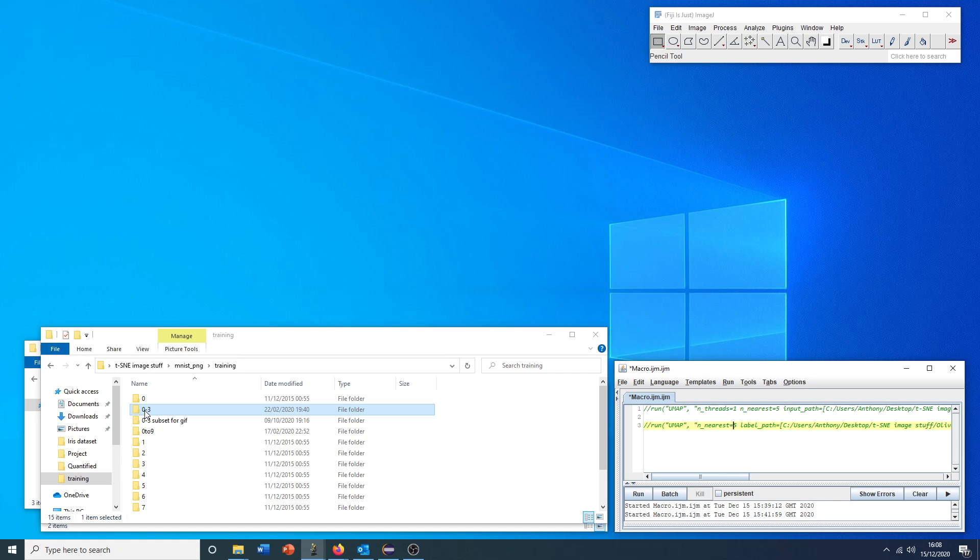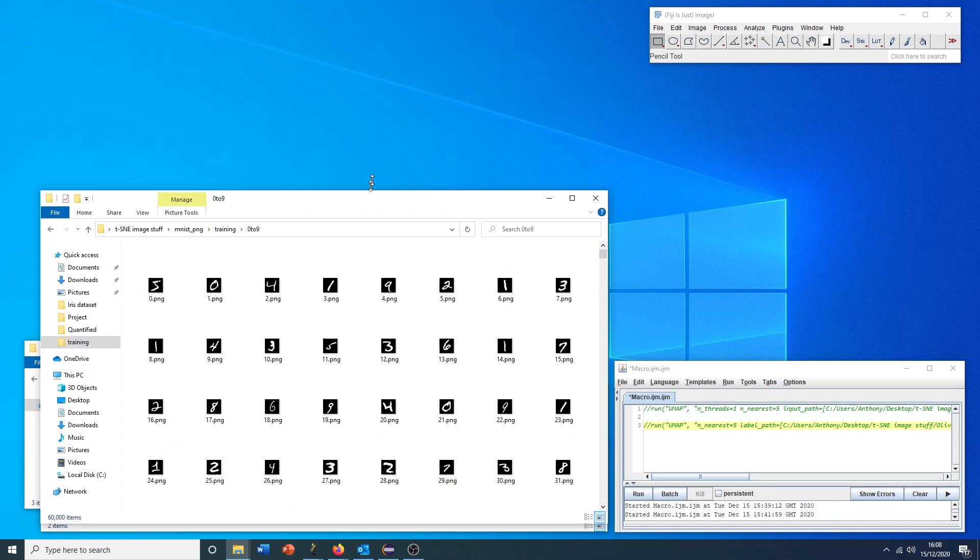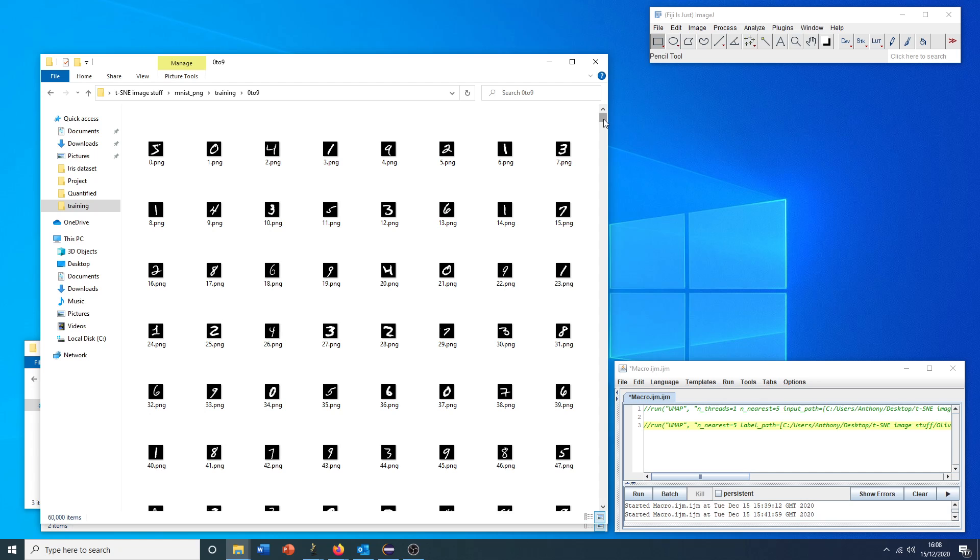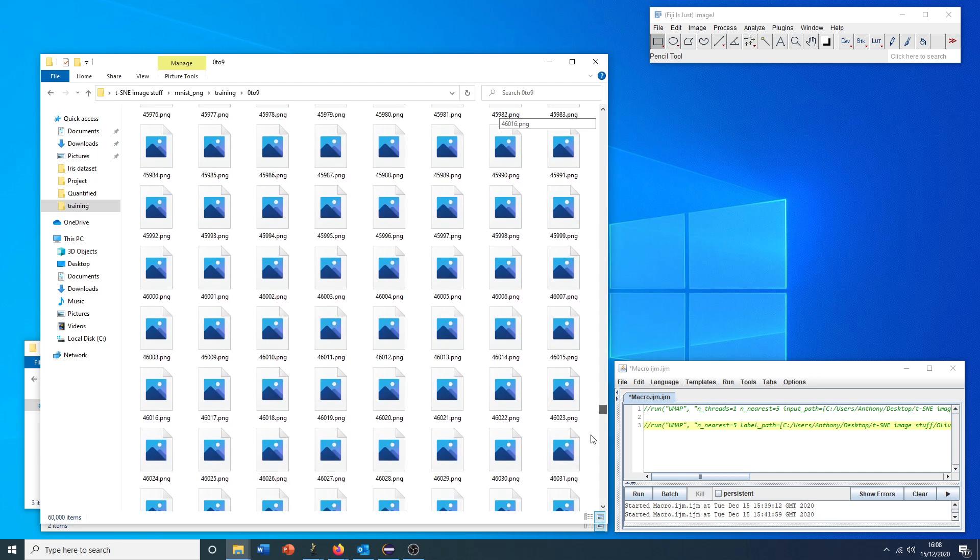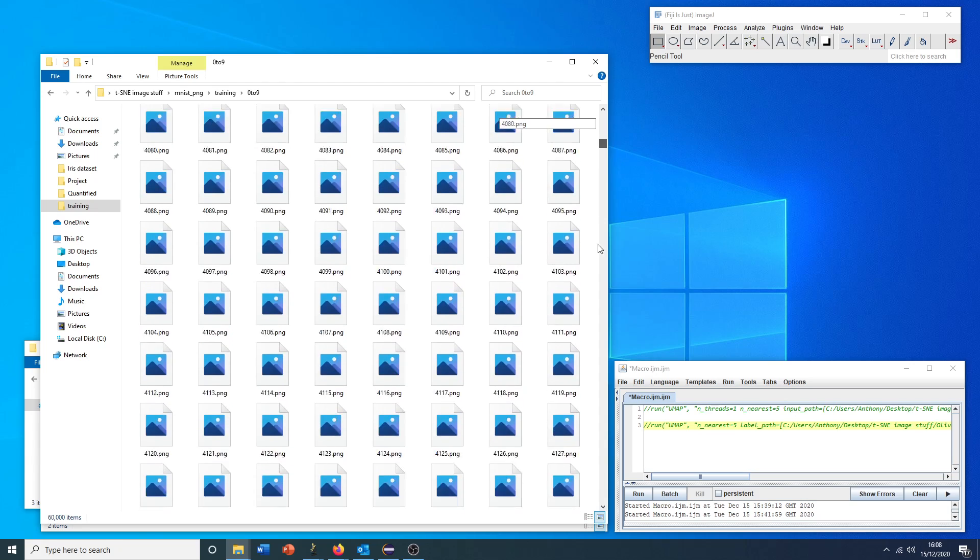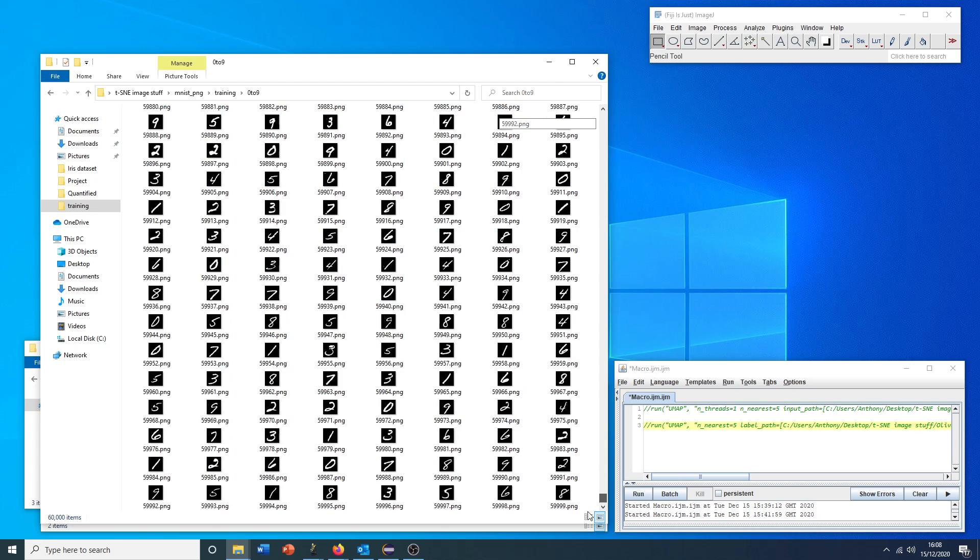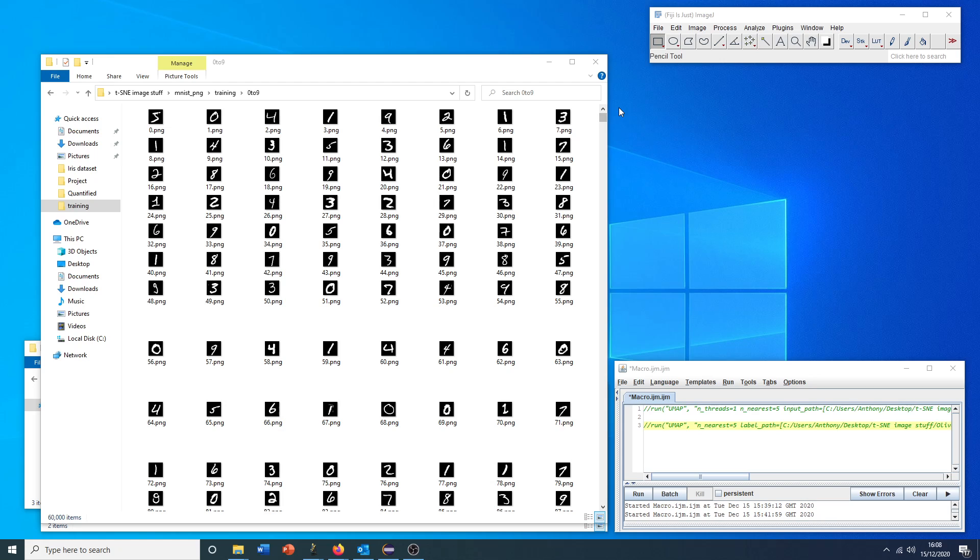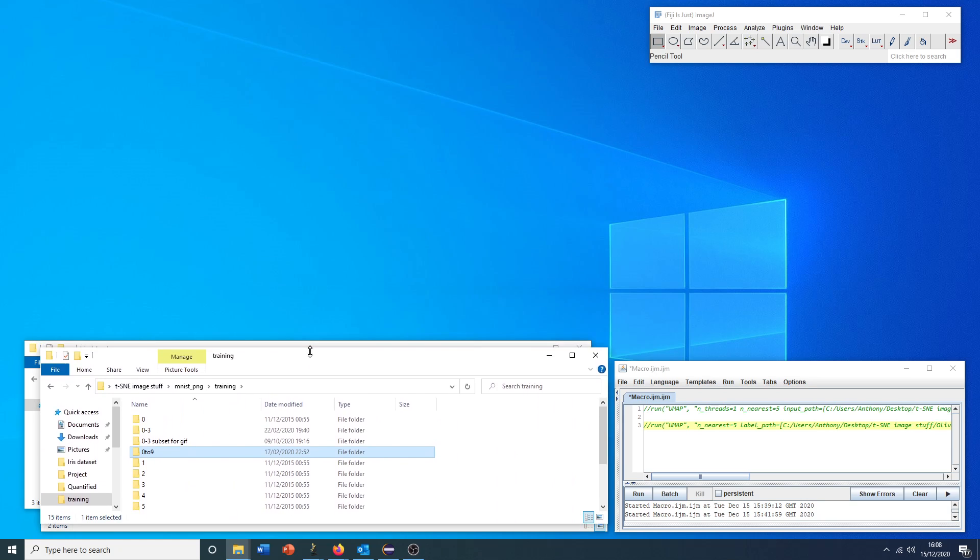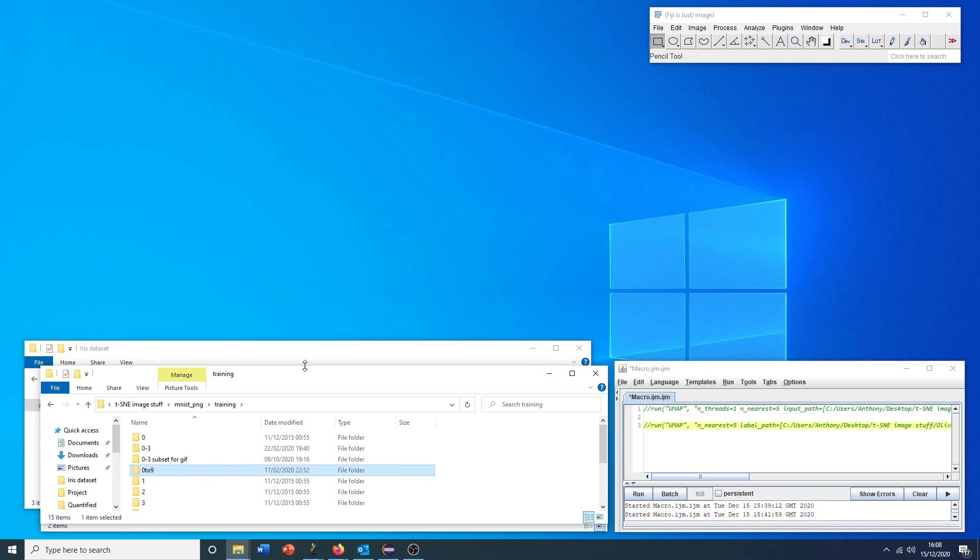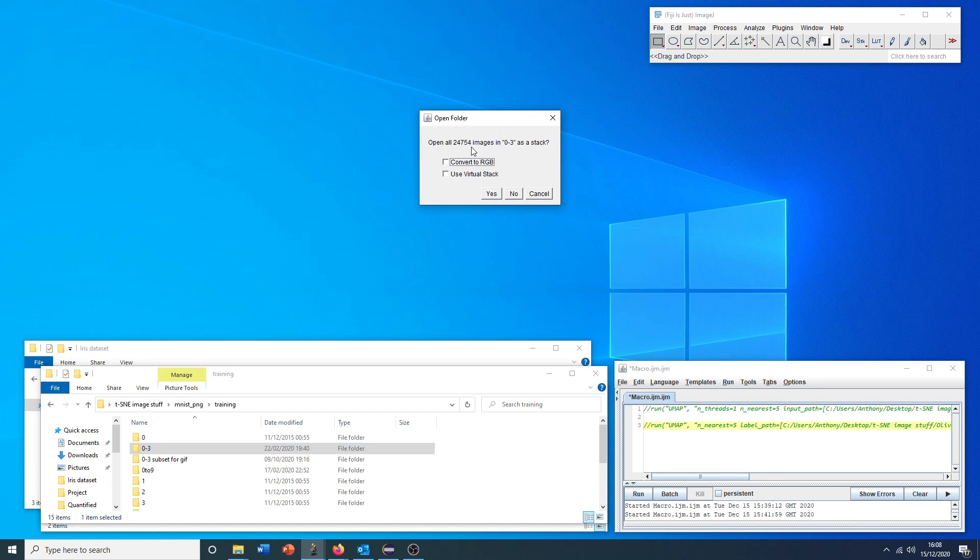So we can open, as an example, the MNIST dataset, or at least a subset of it. The original MNIST dataset is about 60,000 28 by 28 pixel hand-drawn numbers. But just for convenience in this plugin tutorial, I will open a subset of just the numbers 0 to 3. To open this as a stack, we can just drag the folder into ImageJ. We're asked if we want to open these close to 25,000 images. We say yes.